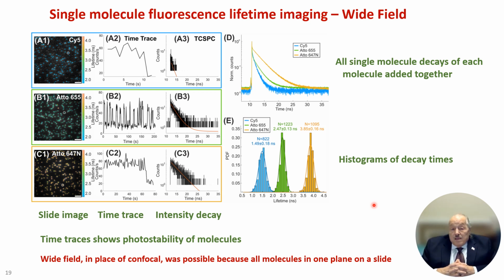Remarkably, you can even do fluorescence lifetime imaging with single molecules. Now, in this case, it's a wide field measurement. The reason this was possible to be a wide field measurement is that all the fluorophores were on a slide, and because they're on a slide, they're in exactly the same focal plane, so you didn't have to worry about out of focus fluorescence. You couldn't have done this experiment in a cell with wide field optics because there would be too many fluorophores that were out of the focal plane.